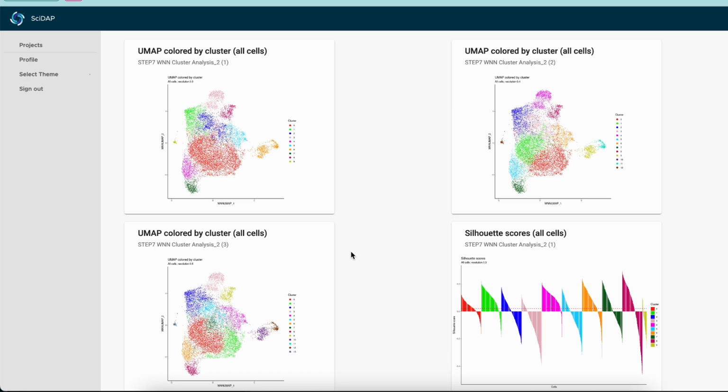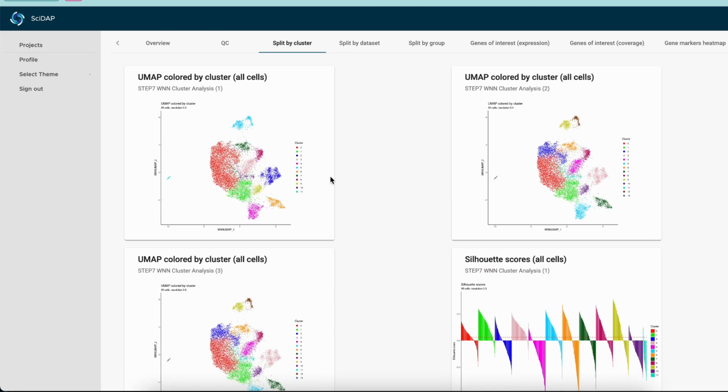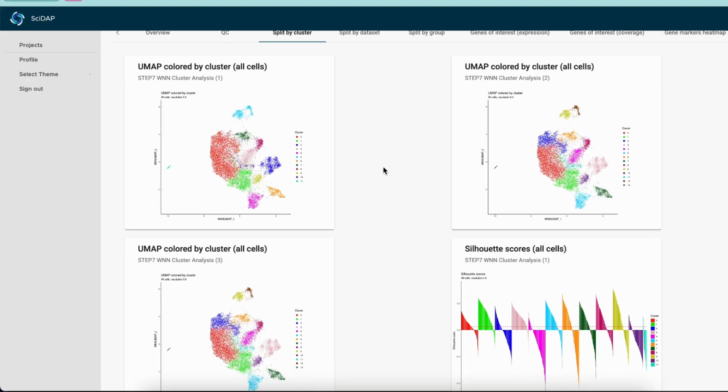They look slightly different, but both of the samples look good. The clusters are distinct, and they don't look like a single bulb of intermixed cells, and this is a good sign.